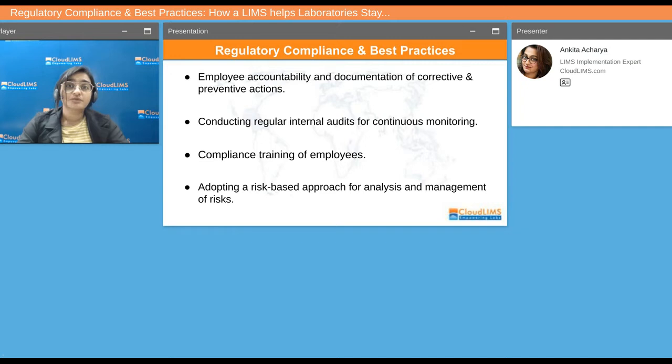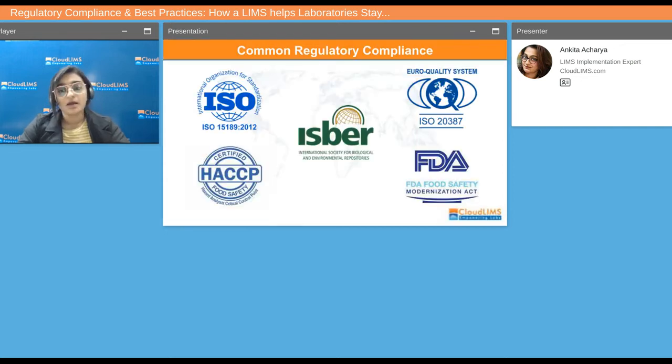We would then move to some clinical laboratory compliance requirements including GDPR, HIPAA, and CLIA. We would then discuss some biobanking information including ISO 15189, ISO 20387, and some best practices that ISBER suggests to help your lab meet those regulatory requirements. And then we'll end the discussion talking about the Food Safety Modernization Act and HACCP, that is the Hazard Analysis Critical Control Point, for food laboratories.